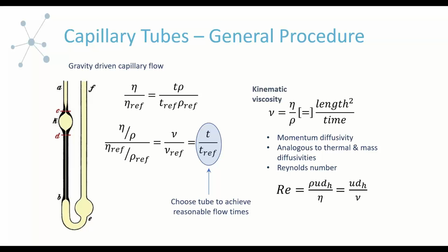So now what I wanted to do is jump on to capillary tubes. And again, I apologize for the equations. But I think we can quickly move through this. And again, it's a very similar concept: you need to choose the right capillary tube for the job. If you think about how you use these capillary tubes, anyone who used them to do intrinsic viscosity knows that although you don't have to use these for intrinsic viscosity, you can use them for just high viscosity fluids as well. They work across the board.